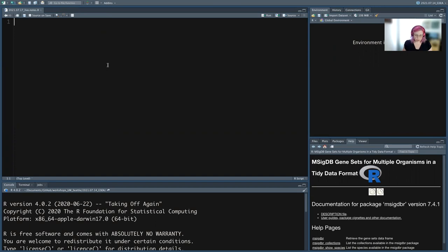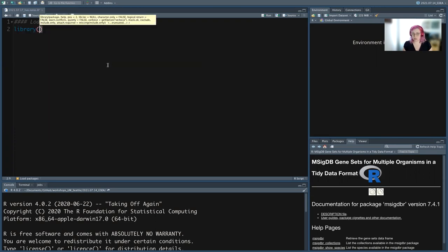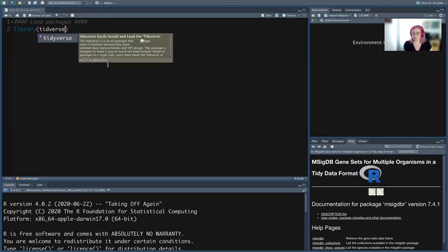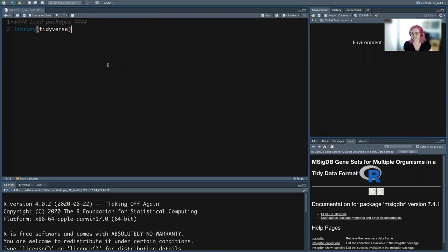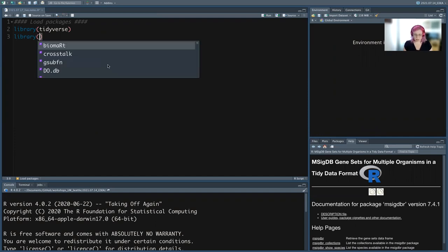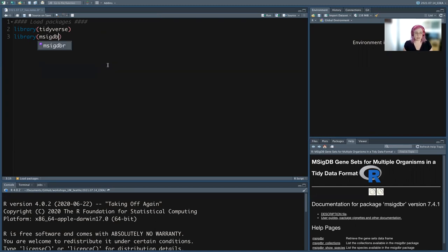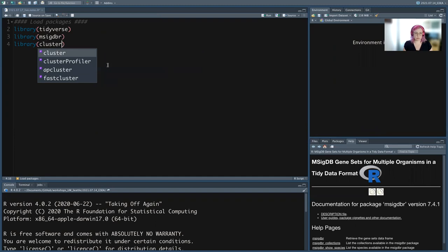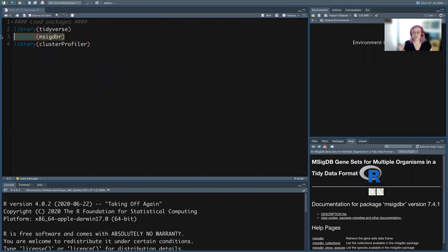To start, I always start my scripts by loading packages. The packages we're going to use today are the tidyverse. You don't have to use the tidyverse to do these analyses, but everything I do in terms of data manipulation is tidyverse. We also need our database — that's msigdbr, the Molecular Signatures Database in R — as well as our actual enrichment package, which is clusterProfiler.